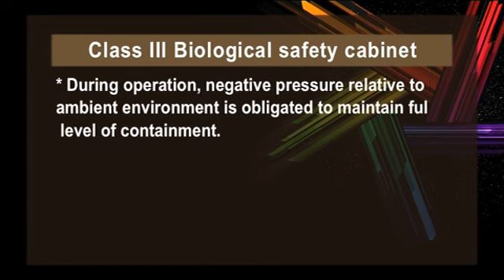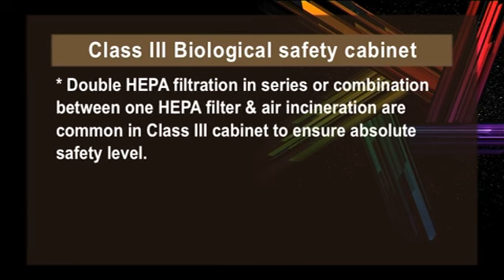During operation, negative pressure relative to the ambient environment is obligatory to maintain the full level of containment. Double HEPA filtration in series or a combination of one HEPA filter and air incineration are common in a class 3 cabinet to ensure an absolute safety level.